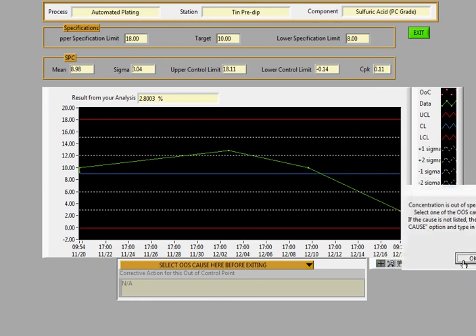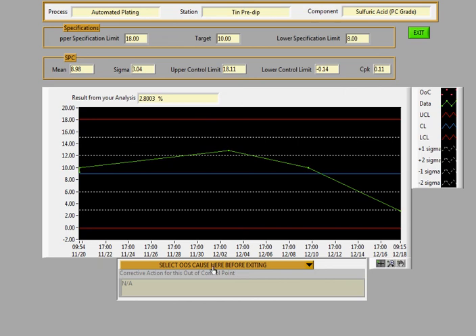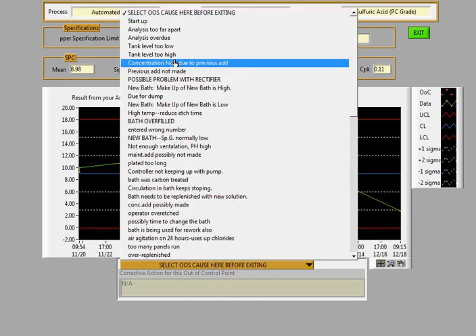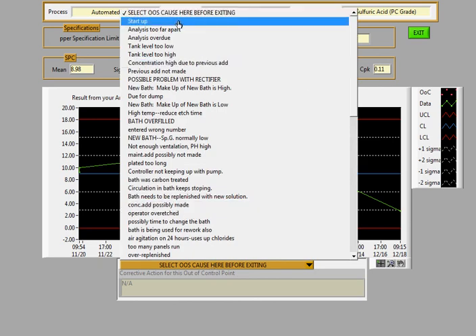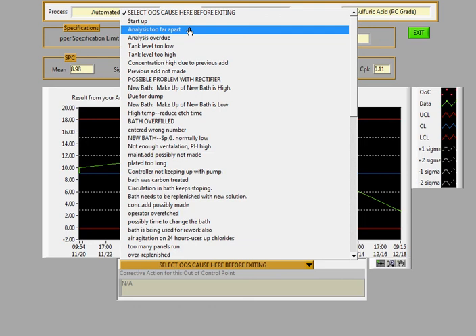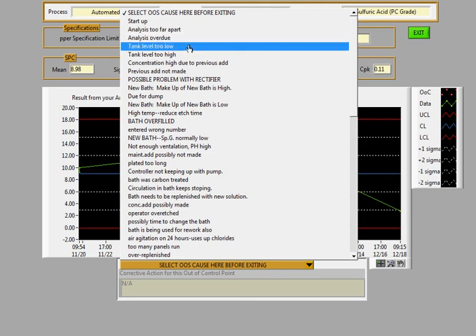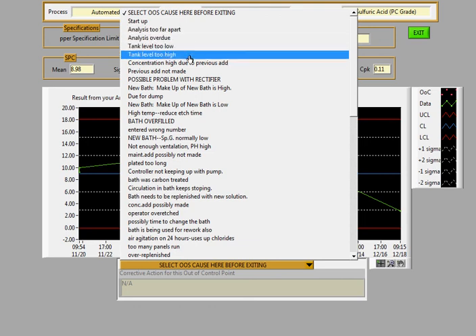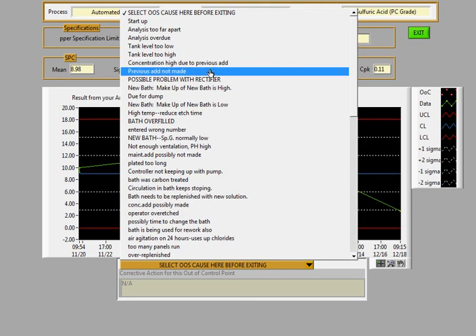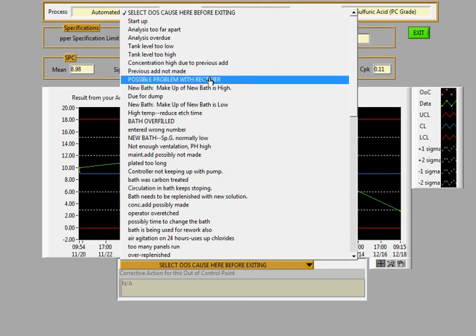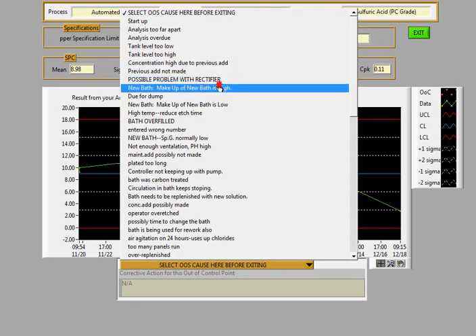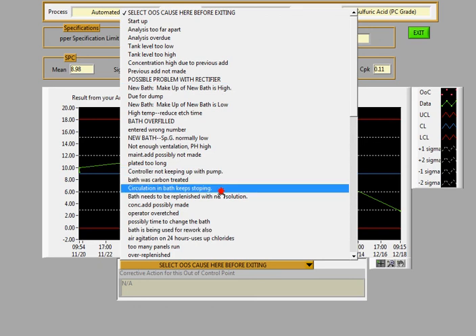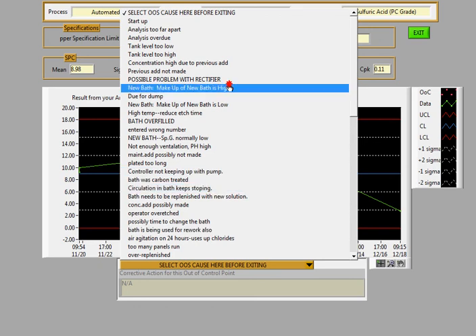Here's where you get to actually select a reason why it was out of spec. So you have startup analysis too far apart, overdue, tank level too low, too high, concentration high due to previous add, previous add not made, possible problem with rectifier, and so on. There's lots of possible reasons for something being out of spec that you can edit and have customized for your application.